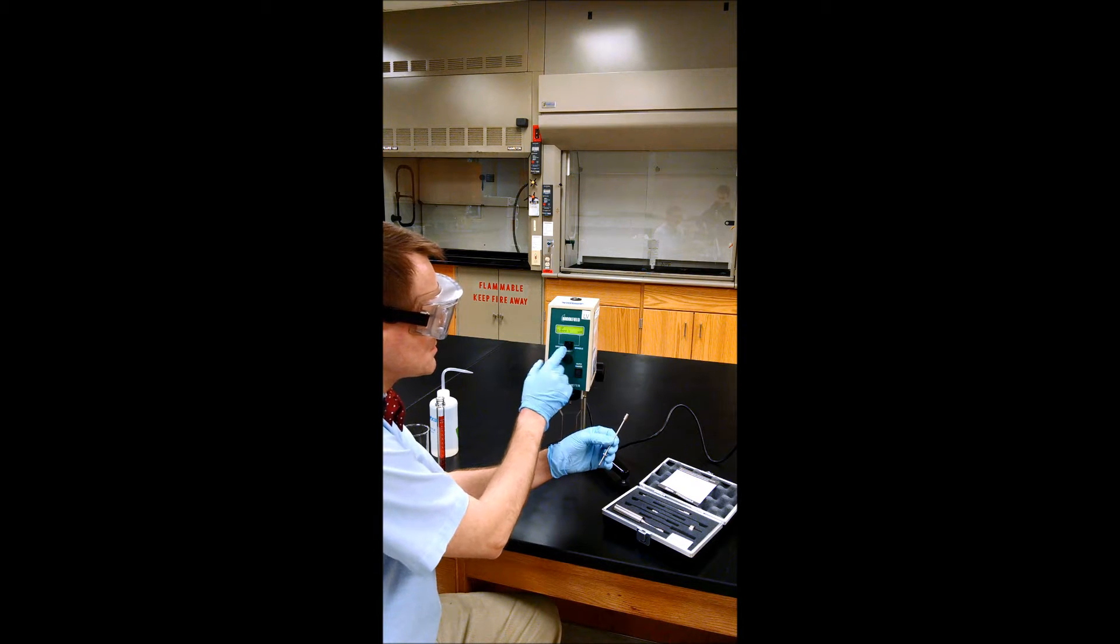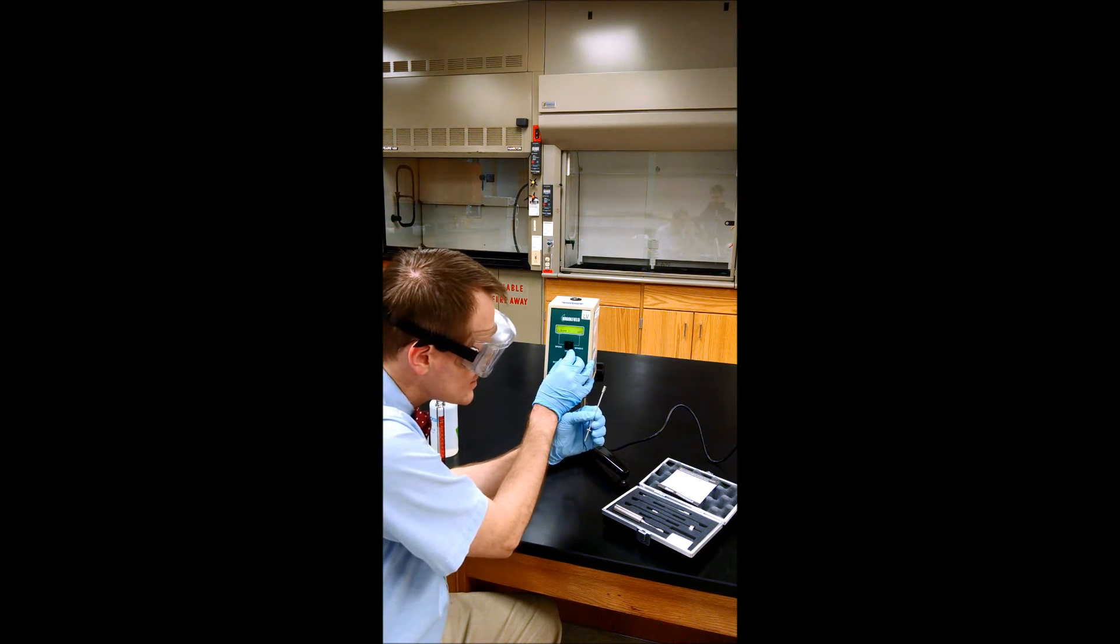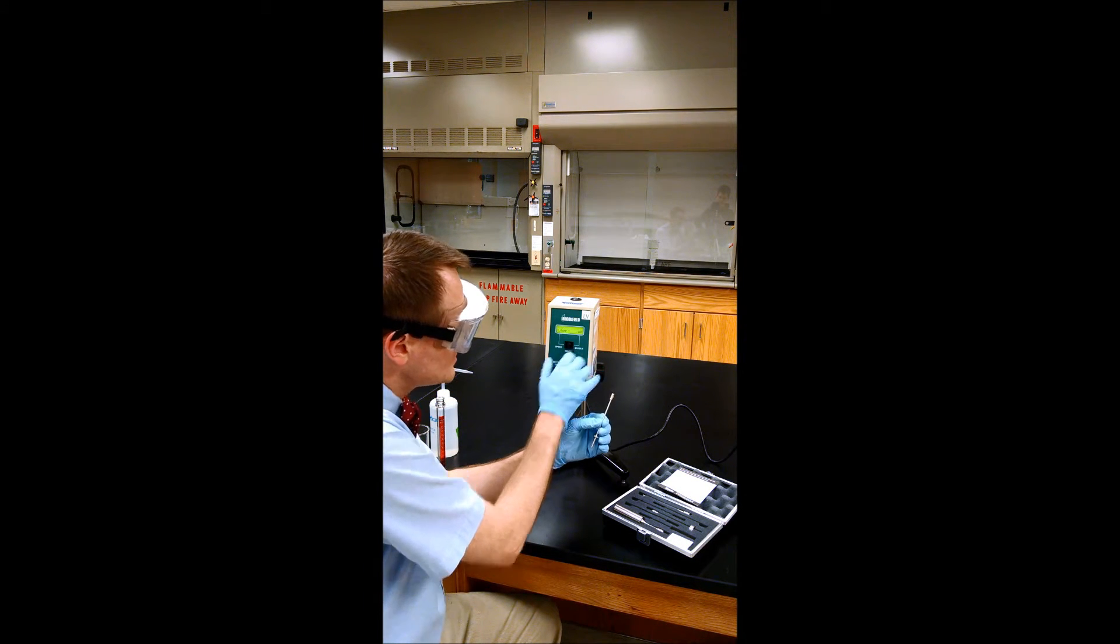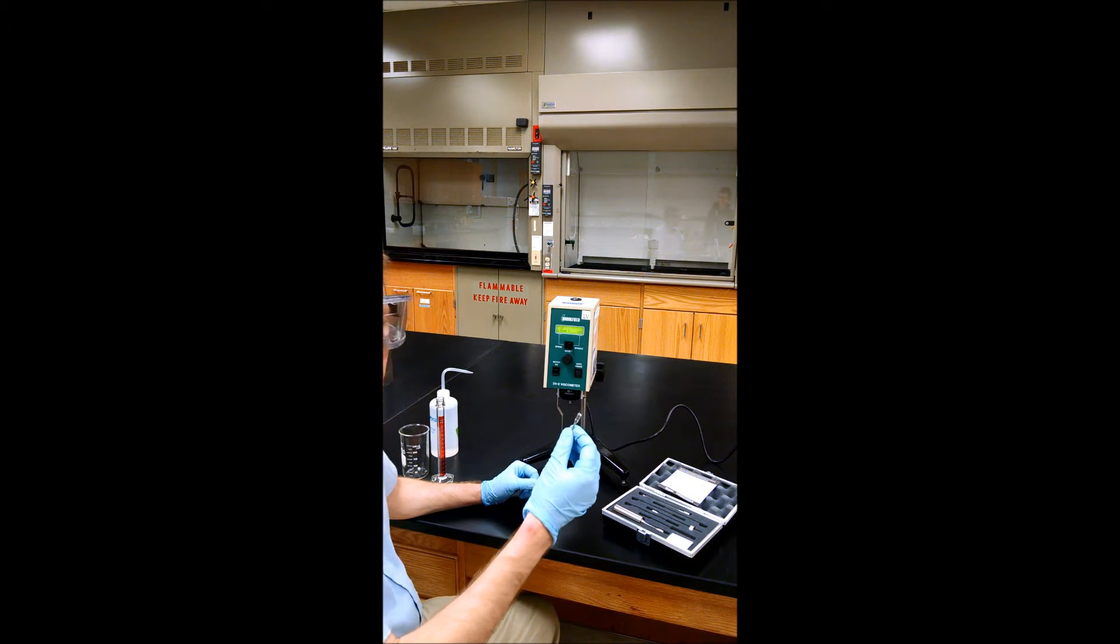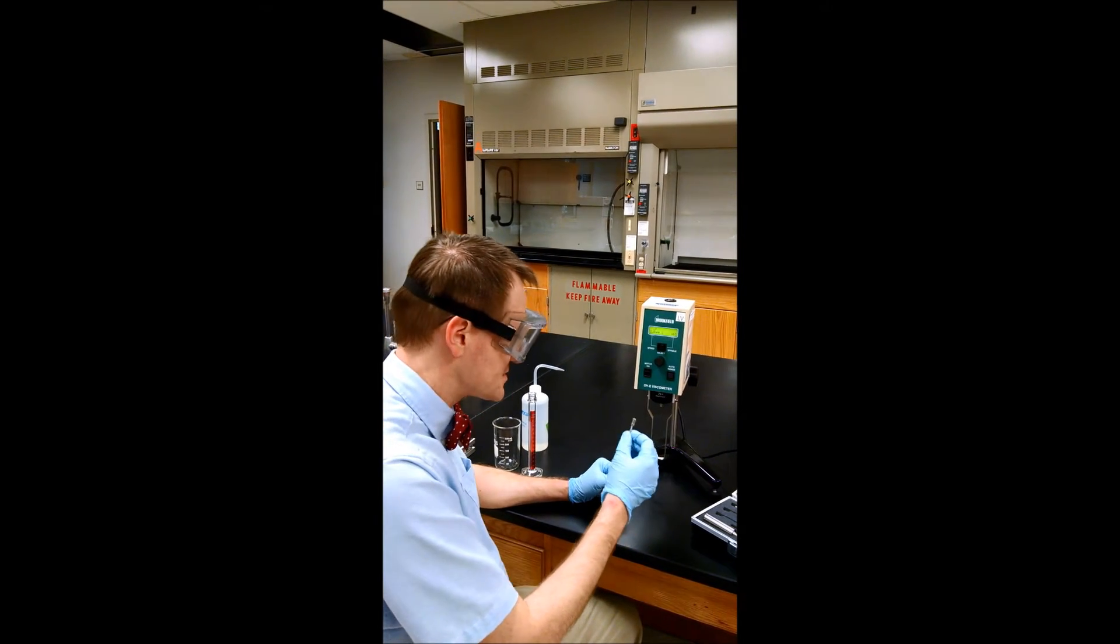Each spindle has a code and we can program in the code by switching to spindle and selecting the spindle number. This is spindle 63, so we dial up to our spindle number. To install the spindle, these are reverse threaded, so lefty tighty, reverse the normal way.